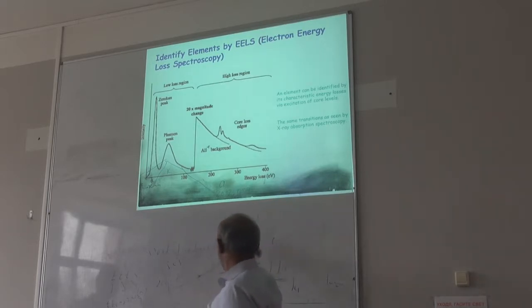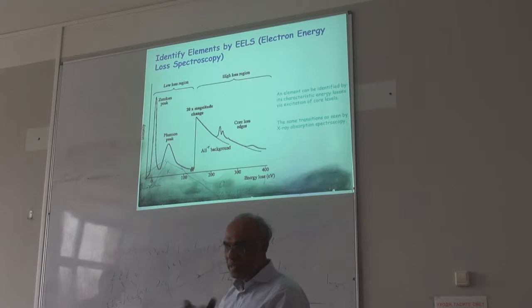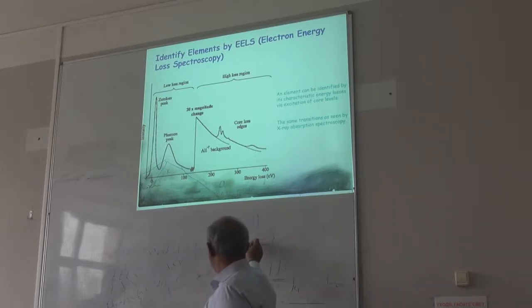So then we know the sample has a lot of vibrational modes, it can have some plasmons and some other transitions. If you have any event here, it will absorb some of the electron energy, and whatever comes out is more like inelastically scattered electrons, right? If you look at that energy, it will give you some information about what is lost here.